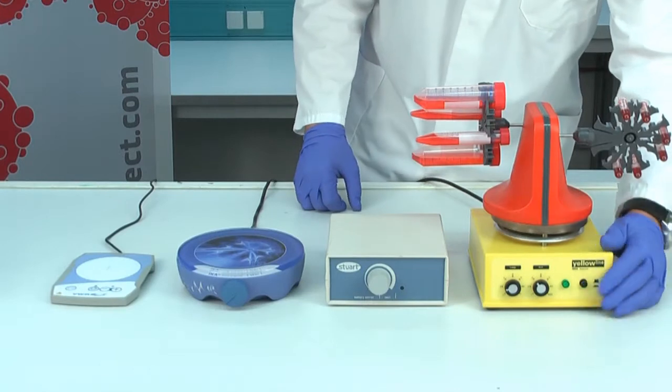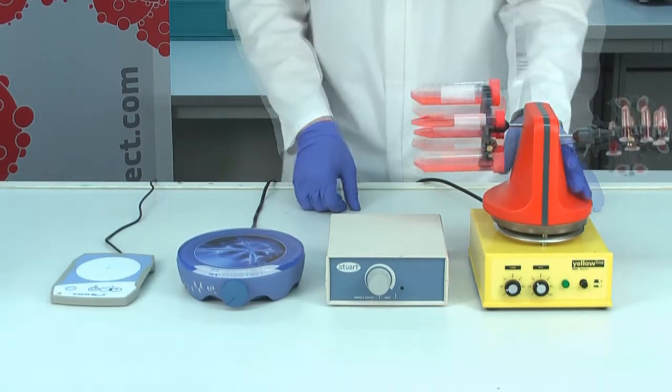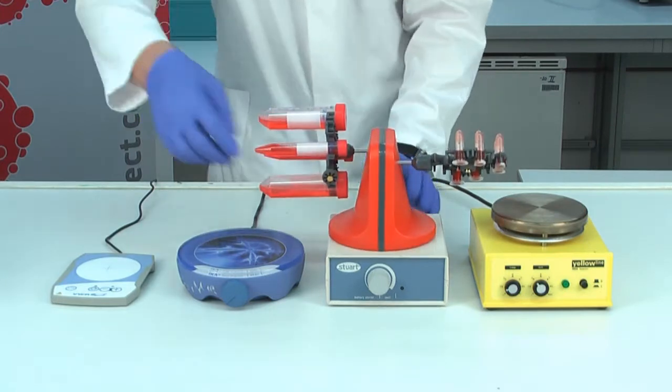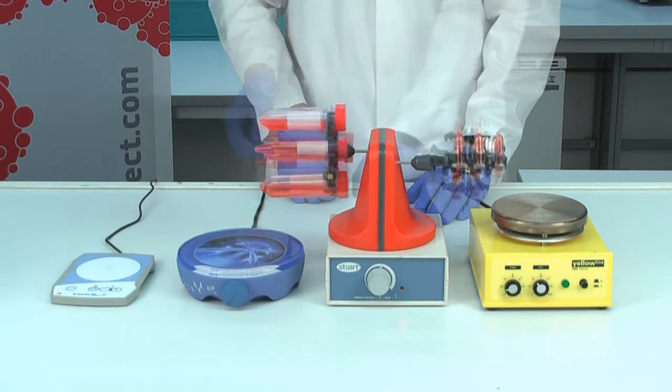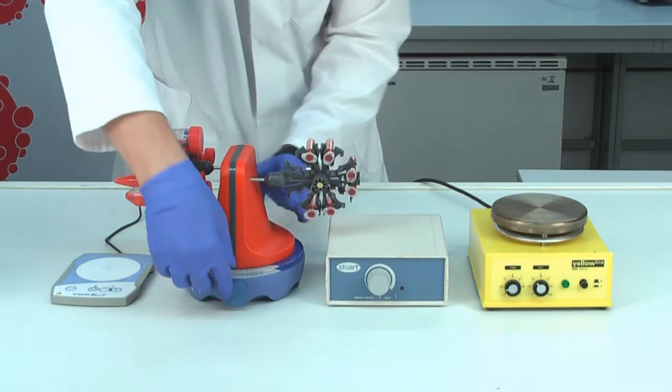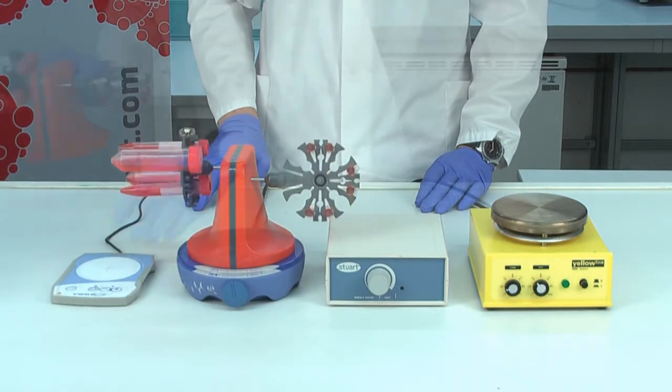Pluriplex works on any magnetic stirrer: a stirrer with heating plate, a battery-driven stirrer, a common lab stirrer, and even on an induction-driven magnetic stirrer.